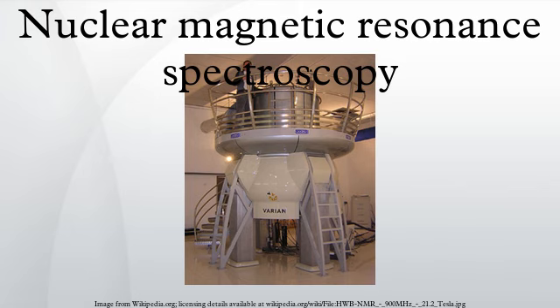In the presence of an external magnetic field, two spin states exist, one spin up and one spin down, where one aligns with the magnetic field and the other opposes it. The difference in energy between the two spin states increases as the strength of the field increases, but this difference is usually very small, leading to the requirement for strong NMR magnets.